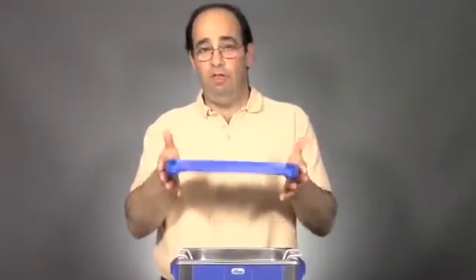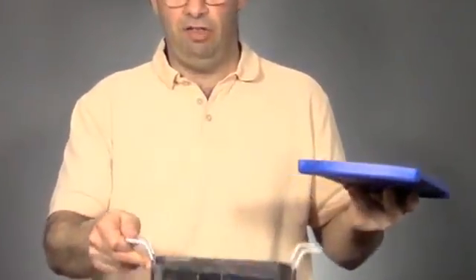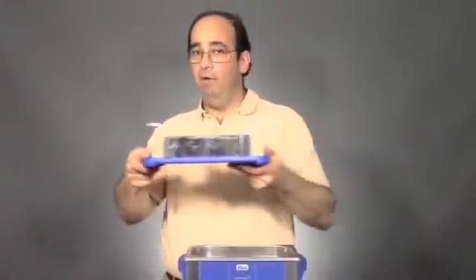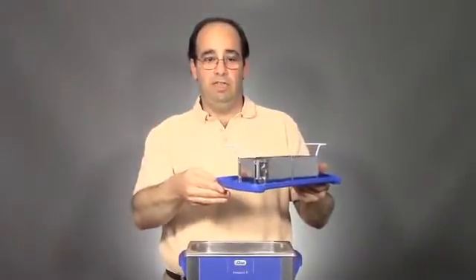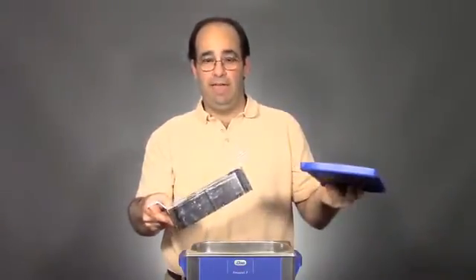It also functions as a drip tray, so you can take the basket out of the heated solution, put it on the lid, and carry it around. The liquid drips into the lid, and then when you're ready, you just pour the liquid back into the tank.